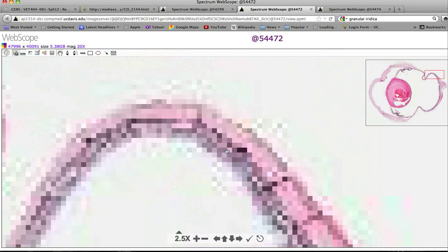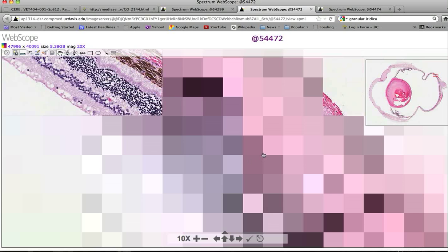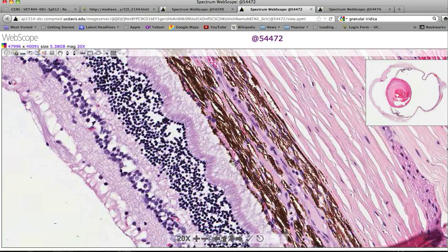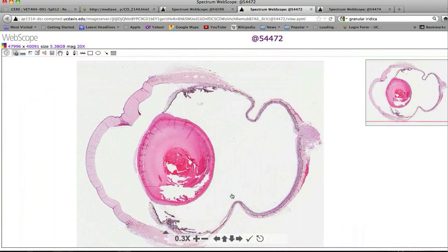Just for fun, take a quick peek at the non-tapetal retina to point out the pigment of the RPE. Even in this digitized view you can see the pigment — this is a little tinted, which we talked about being an artifact. So pigmented RPE where there's no tapetum — this is the non-tapetal retina. That concludes the tour of the normal vertebrate eye. Installments about some of the pathology and lesions will follow in the next couple of days. Enjoy, and thanks for listening.